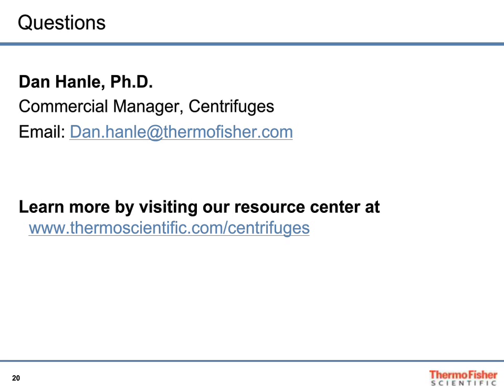These days, given the larger blood bag sets that we have today, these quads and quints and filters and the fills going up to, heaven help us, 550 mLs from 500, you probably do want to look at who you're talking to about the centrifuge to see what the capability they have in the actual buckets themselves. Sometimes the customers refer to them as cups. Make sure you know that centrifuge is capable of spinning the large bag sets you're going to be wanting to do.